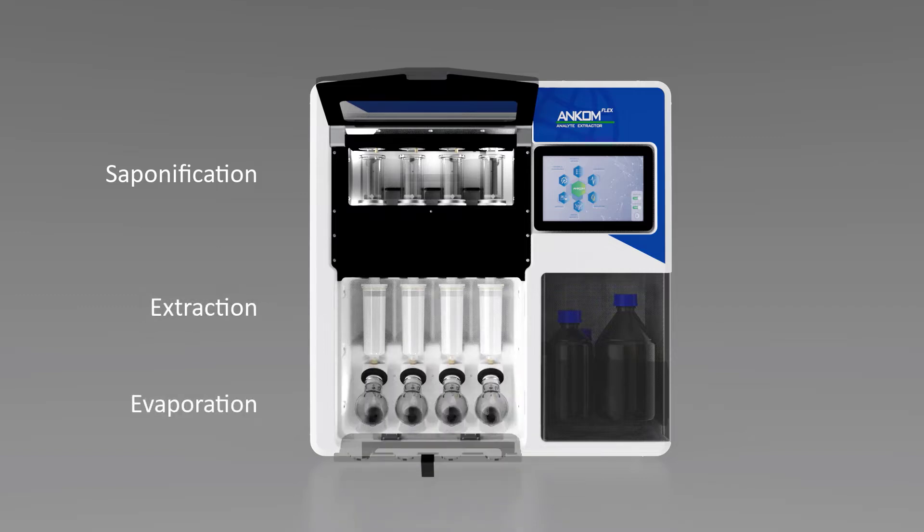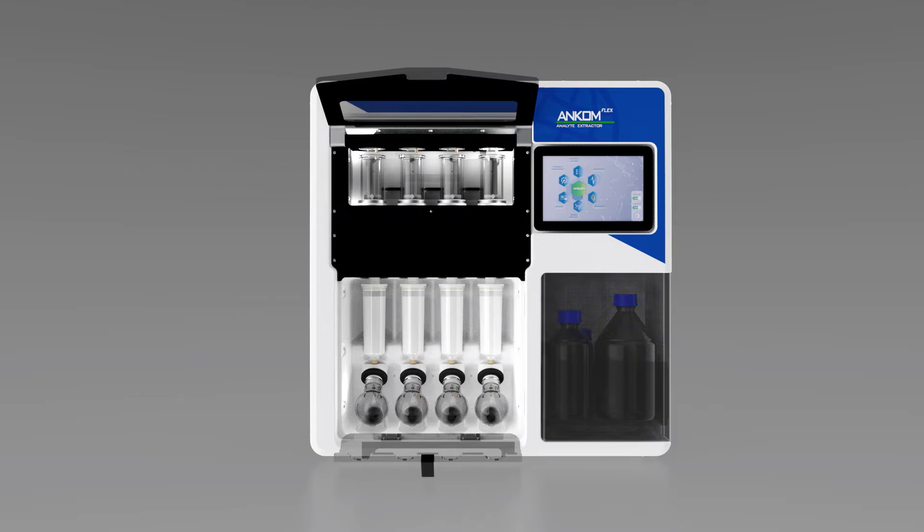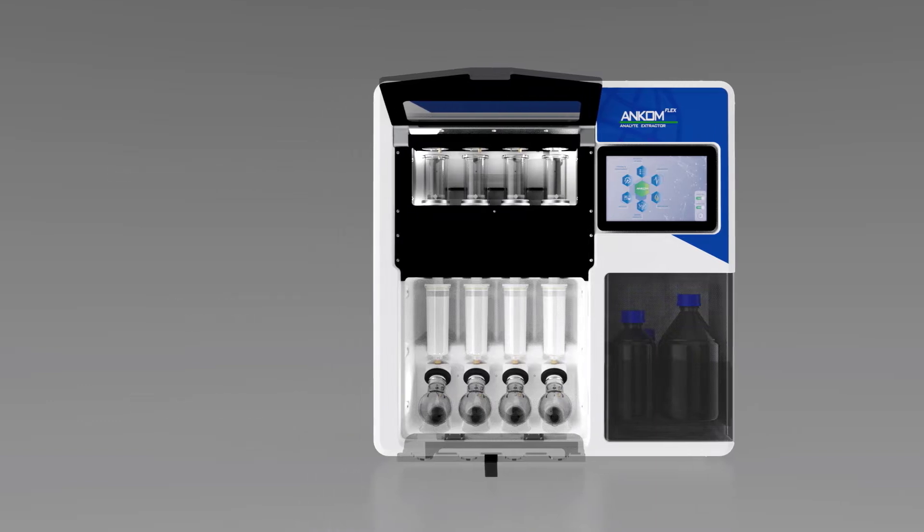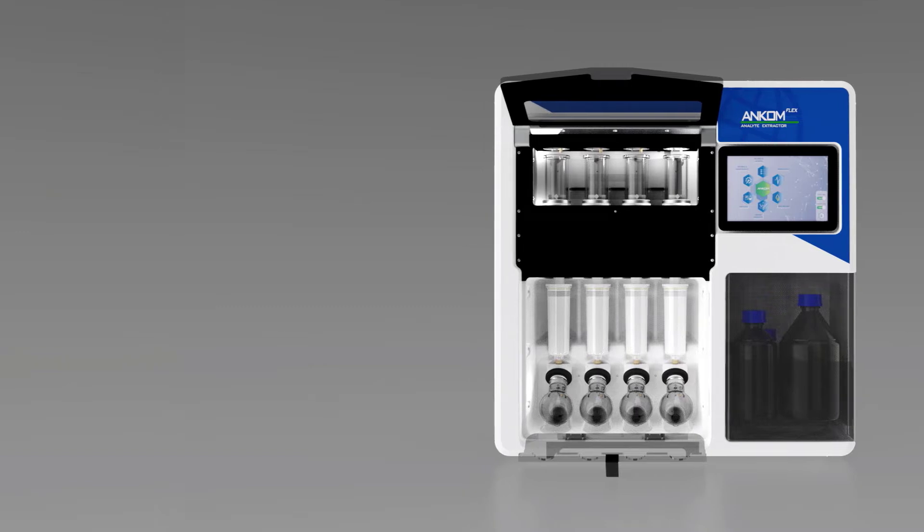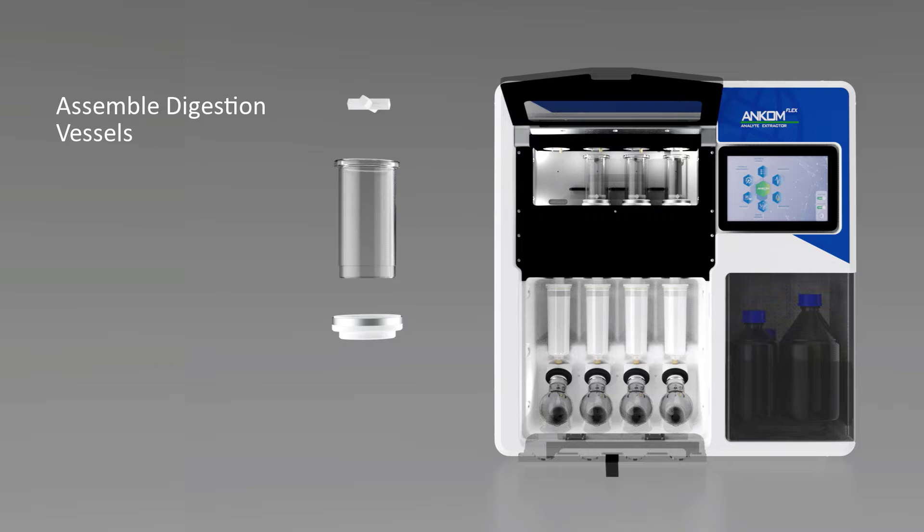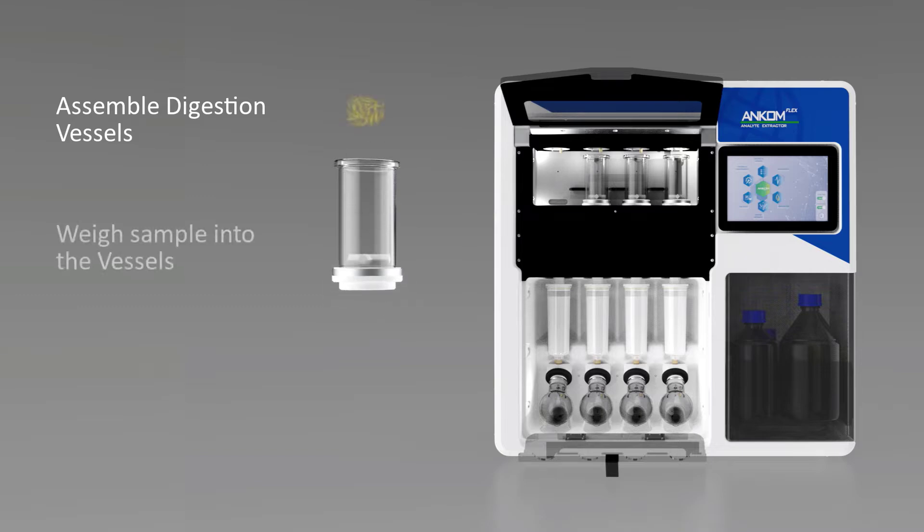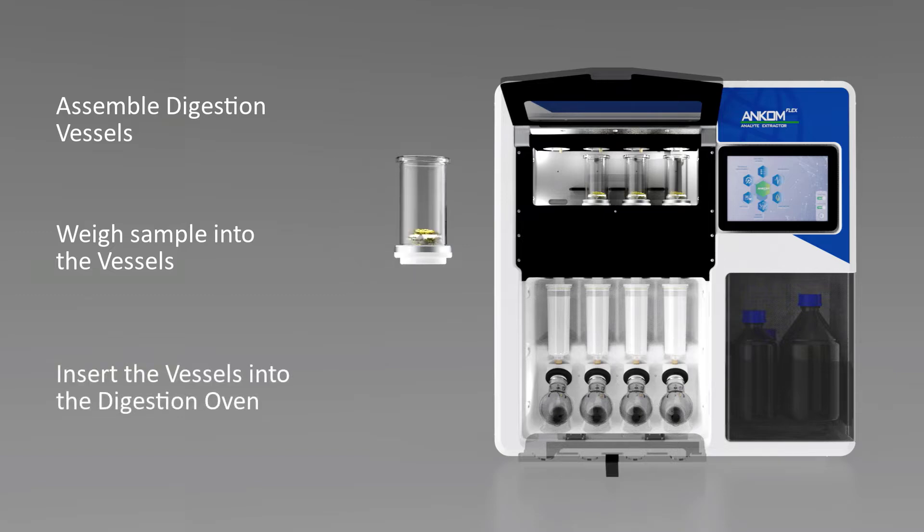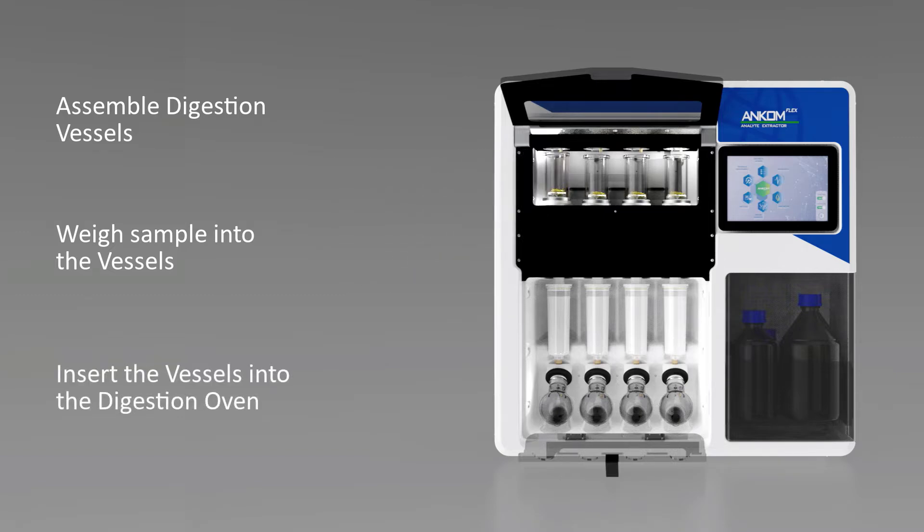The ANCOM Flex Analyte Extractor is easy to use. Following computerized prompts, the user simply assembles the digestion vessels, weighs sample directly into the vessels, and inserts the vessels into the digestion oven.